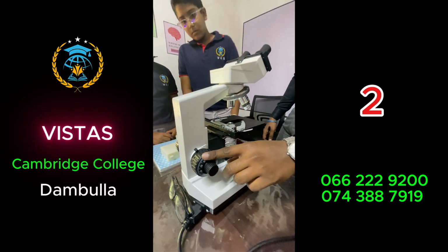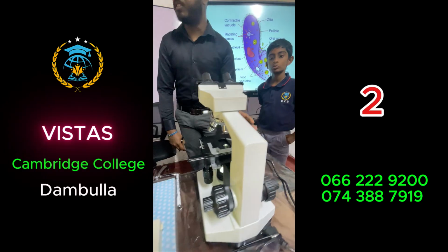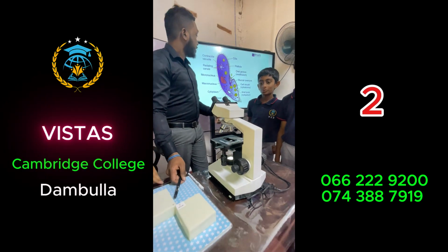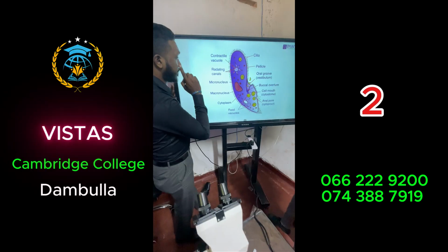And these are knobs just for adjustment. And these knobs are for adjustment of our stage, which is this. Okay. So today we'll see this paramecium. Just try to identify this paramecium.